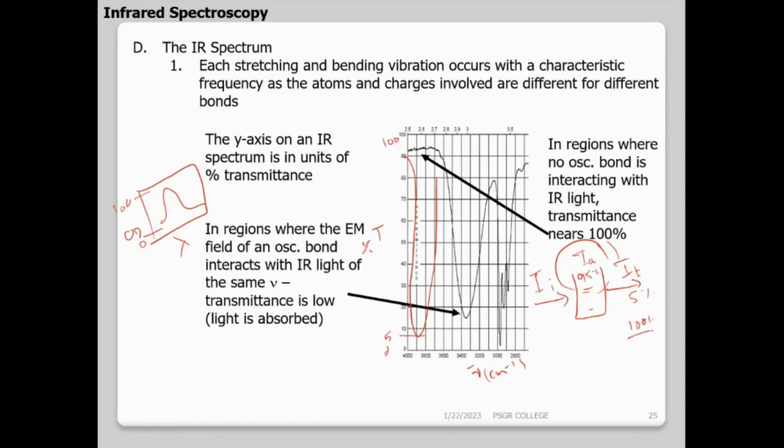No, I say 100% transmittance. Transmittance is 100%. That is, the radiation came in and went out. So what does it mean? No absorption. The absorption is zero. The compound has no dipole moment. There is no dipole change, no oscillating dipole, no absorption.